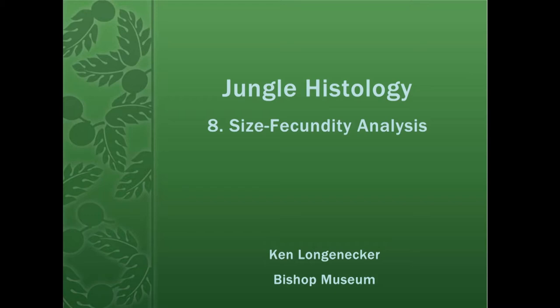My name is Ken Longenecker, and this is the 8th of 9 modules designed to teach anybody who's interested how to perform the methods my colleagues and I use to describe the reproductive biology of reef fishes. The topic of this module is going to be the relationship between the size of a female and the number of eggs that she produces.